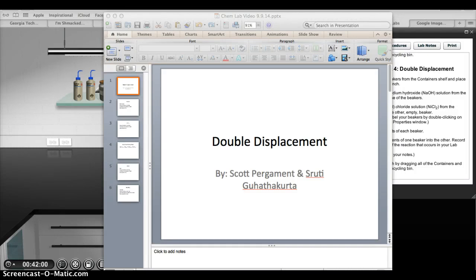All right, my name is Scott. My name is Ruthie. And we're going to show you a double displacement reaction.